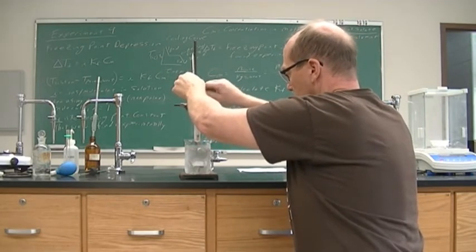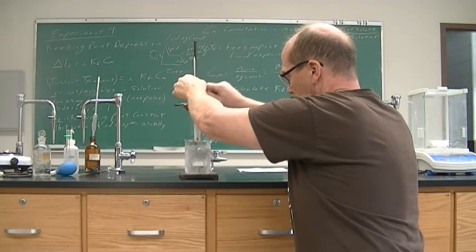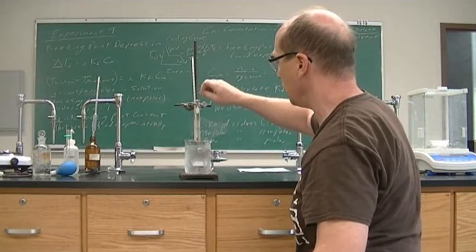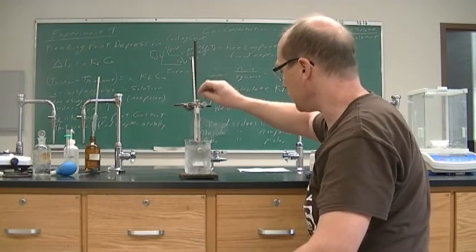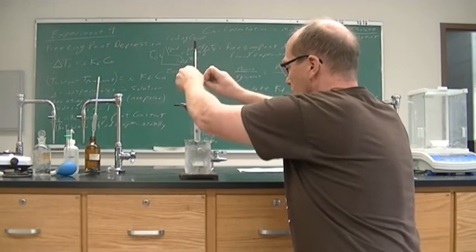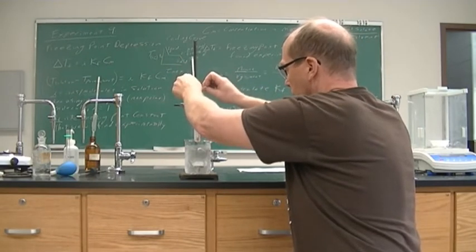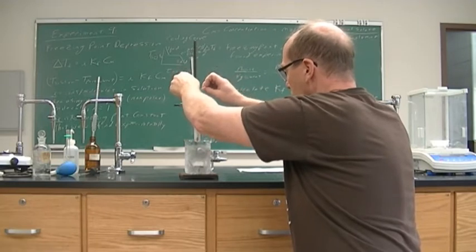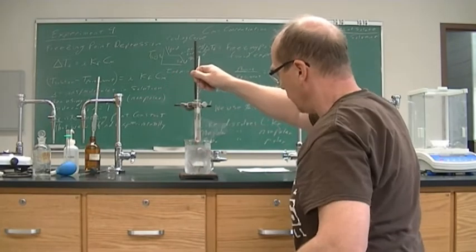So when you have your solubilities, remember that it's more soluble when something is hot. Of course, it's going to be less soluble when something is cold. And this is very cold cyclohexane. We are still, it's raising, but it hasn't hit 10 degrees yet.